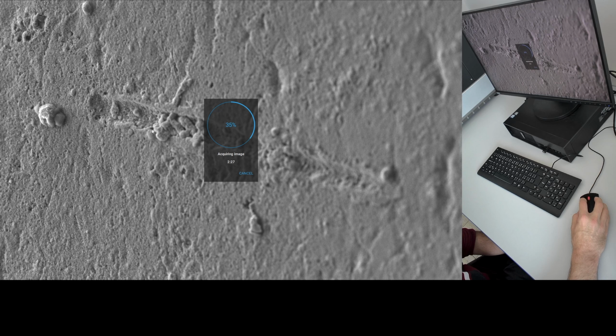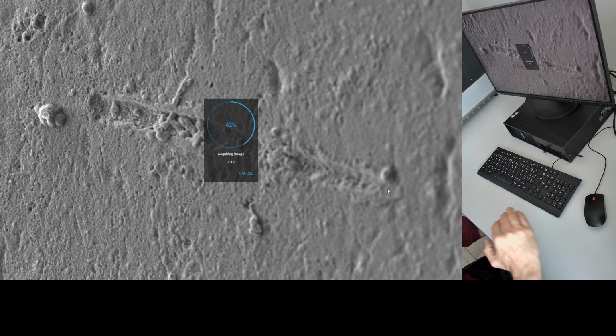Showing, in my view, the responsibility for doing the damage here. Okay, this is going to take a bit of time because currently I'm focused somewhere down here. I'm going to move the focus to here, maybe here, and maybe here, because this is on the angle of the sample. I'll need to stitch these together, but wow, what a pleasure and an honor to be looking at this.